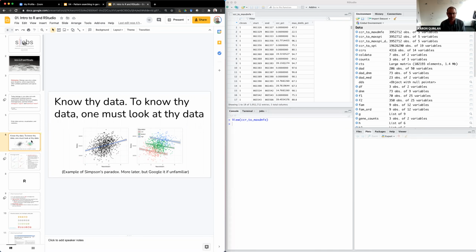So one of the first things that we must do when scrutinizing our results is to look at it, to visualize it. And that's everything from basic scatter plots that are shown here to more sophisticated visualizations for quality control and things like that that are germane to RNA-seq and ChIP-seq and mutation detection and all sorts of things that we do.